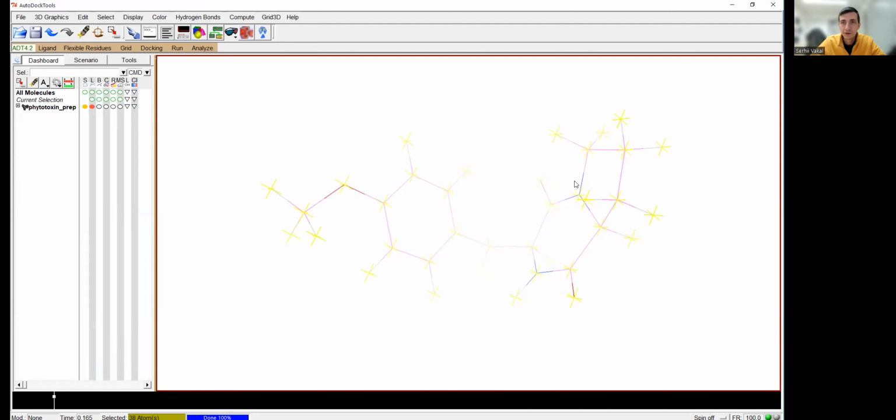You should memorize from the very start that when you press here, it doesn't mean selection. We don't see any selection stars here. So it is not enough just to click on the molecule to select it. You have to explicitly click this circle in the selection column. Only after this, the molecule will be selected. Please remember it. Then the L column stands for lines.